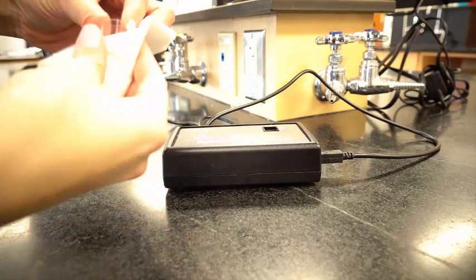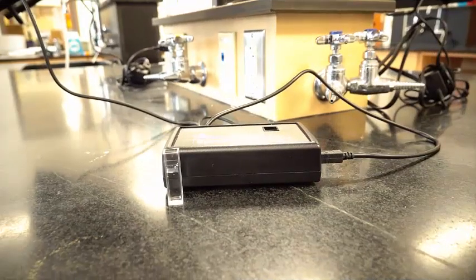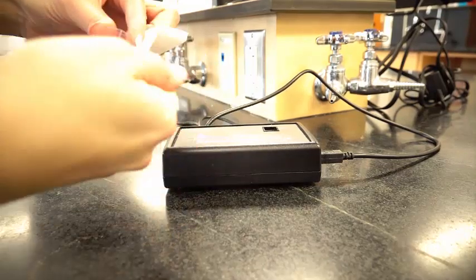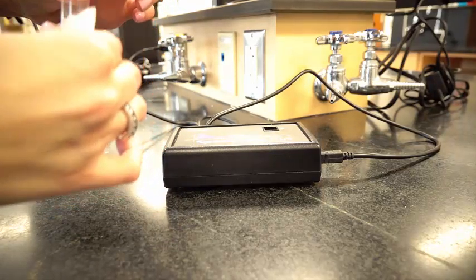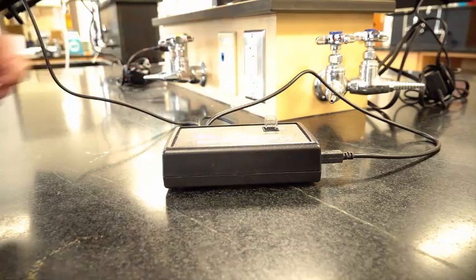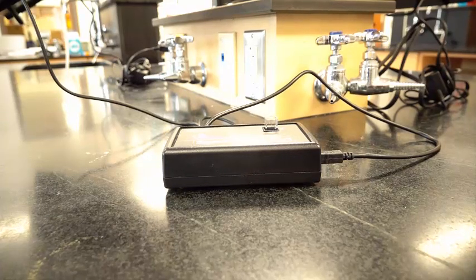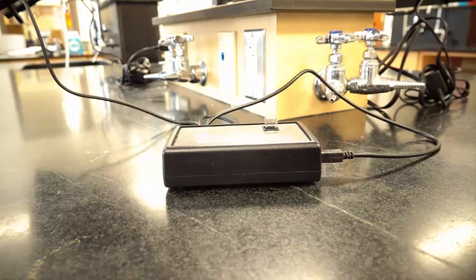of your blank solution, which is labeled Beaker 1. Be careful to hold the sides of the cuvette only, as fingerprints can absorb light and skew your sample. To remove any fingerprints or water drips, you should wipe down the cuvette with a Kim wipe before you place it in the spectrometer. A Kim wipe is a lint-free tissue. Do not use a regular paper towel, which can leave lint behind and even scratch your cuvette. If you see any air bubbles in your sample, you should dislodge those by tapping your cuvette on the table, as air bubbles will absorb light differently than your liquid sample.